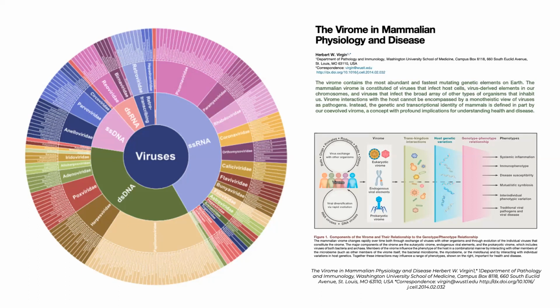That is the answer that I was looking for, because having no reference genome, we have short reads, and those short reads could be mapped only to the genomes that we know. If there are a lot of genomes that we don't know, we have to assemble them. But if we are sequencing many viruses at a time, how do we actually identify which ones go together, right? So a huge challenge is the ability to know what is the reference genome.